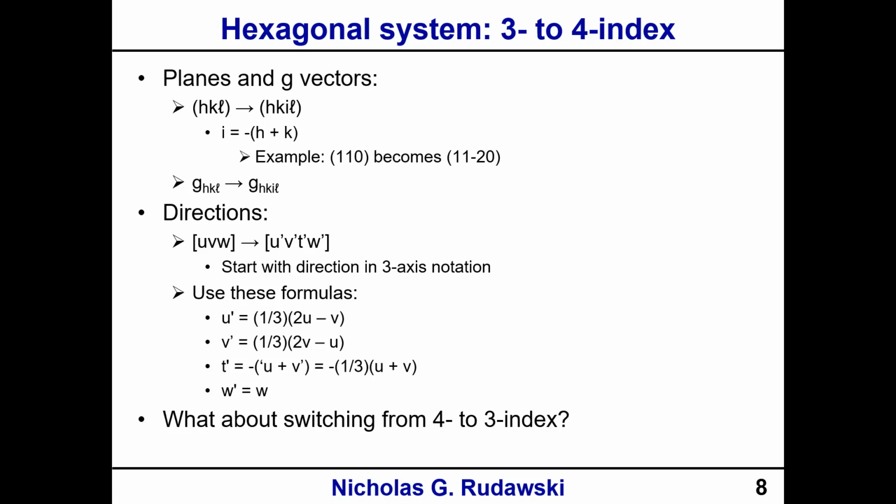Okay? That would be the appropriate direction for index notation. So you could do that yourself and verify that when you have a minute. We're going to work through plenty of examples of this as we're going through this.